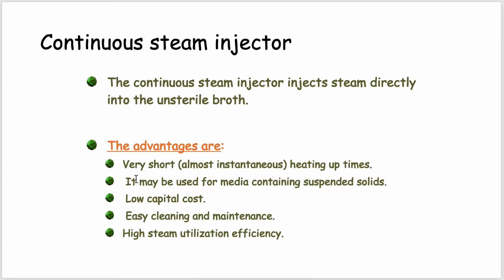The advantages are very short heating up times. It may be useful for media containing suspended solids, because if we want to sterilize media with suspended solids in a continuous way using a continuous plate exchanger or a spiral exchanger, in either case there is a chance that the suspended solids may deposit there and block the sterilizer.